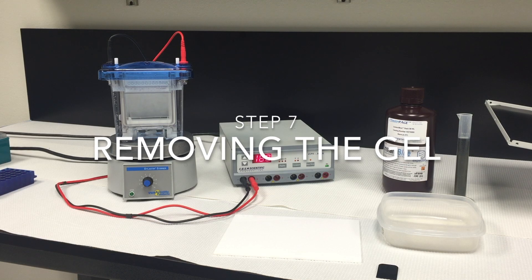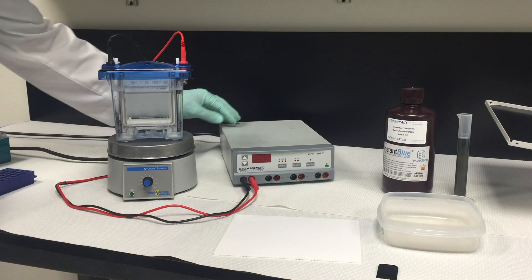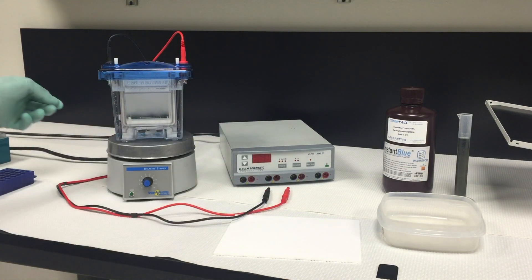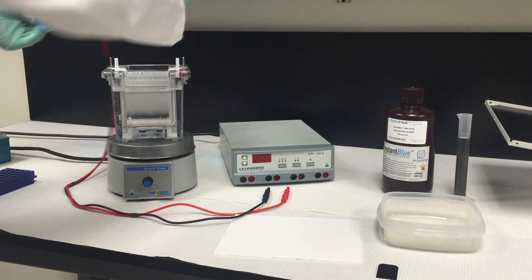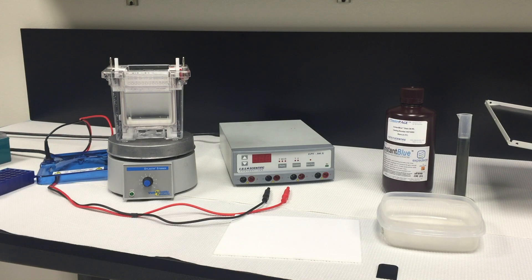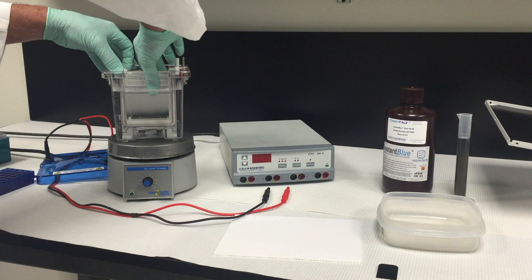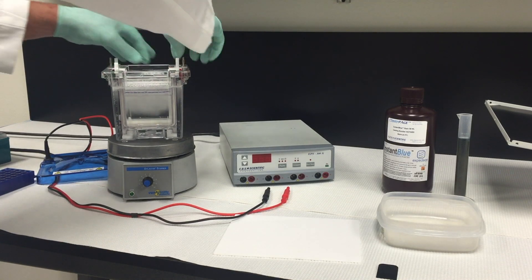Step 7: removing the gel. Turn the power supply off and disconnect the leads from the power supply. Remove the safety cover from the unit. Leaving the core in place, pull up on the gel door latches and open the door. Remove the gel cassettes.